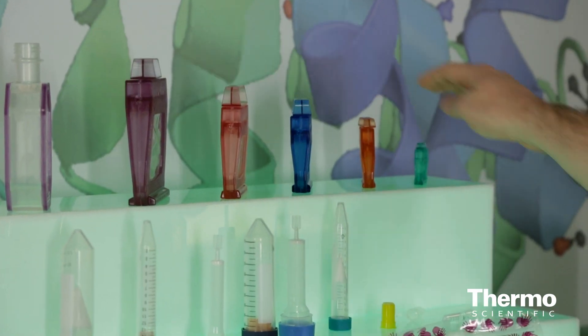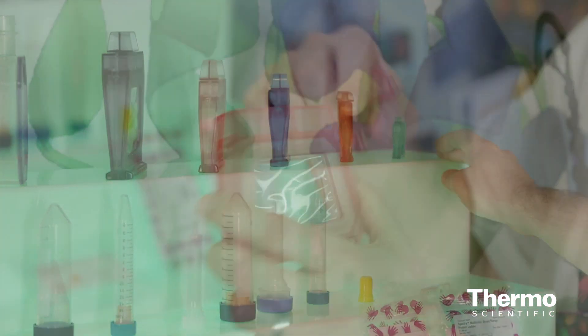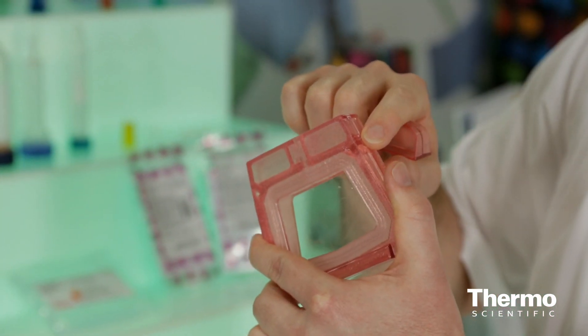Obviously, there are other ways to do dialysis, but the thing that makes these great is that they are very efficient — you don't have to worry about sample loss. A lot of times in the old days, you used what was called snake skin, and you had to pinch the skin, which was really hard to do right without causing leakage. You can imagine if you're submerging your sample into a buffer, you don't want it to leak out and lose all of your sample. This provides assurance that you're not going to lose your sample and that you'll still be able to do the buffer exchange you need for your downstream application.